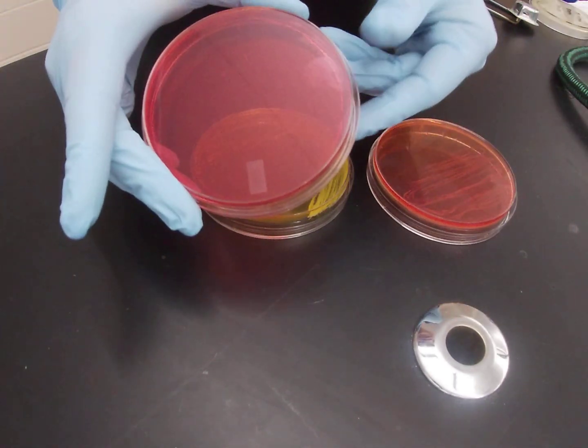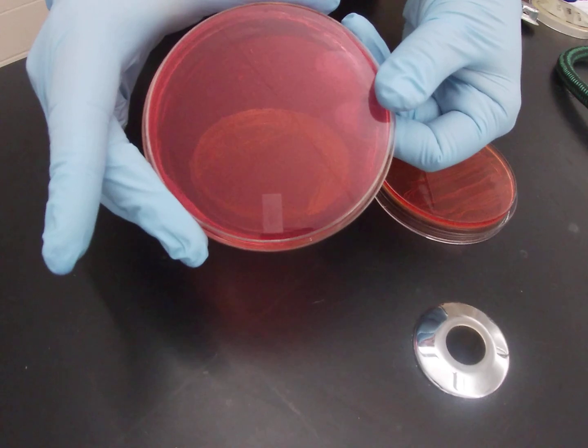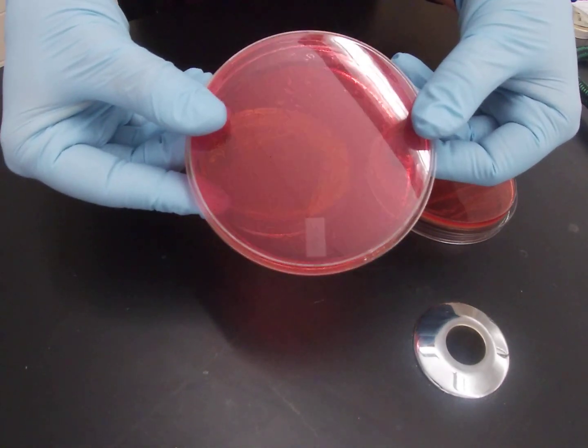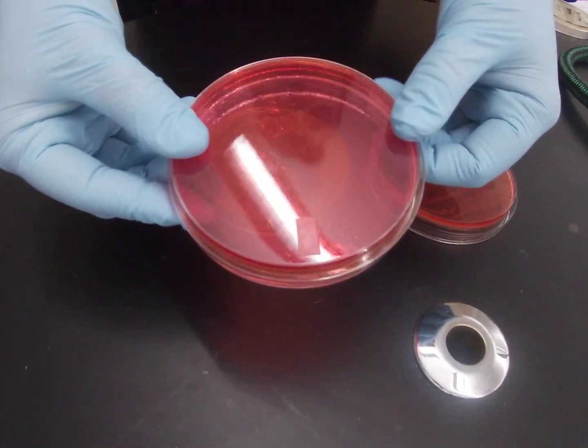Here is an un-inoculated mannitol salt agar. As you can see it is completely clear and it is a bright red, almost kind of pink, sometimes a little bit of a reddish orange in color.